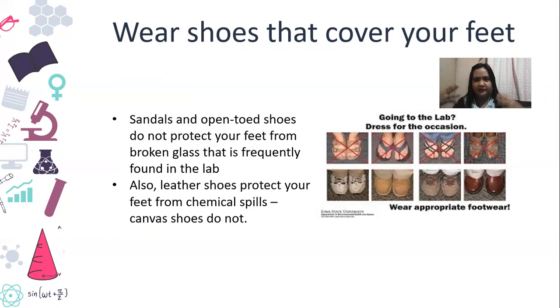For example, right now it's rainy season and you have to go to the lab, but going to, let's say, your place, Holy Angel University, it's flooded, so you have to wear slippers. So make sure if it's a laboratory class, bring shoes which are covered. So these are not allowed, but these are allowed.